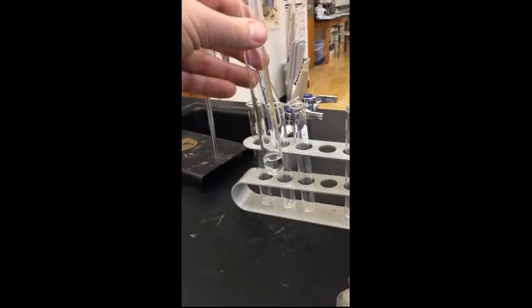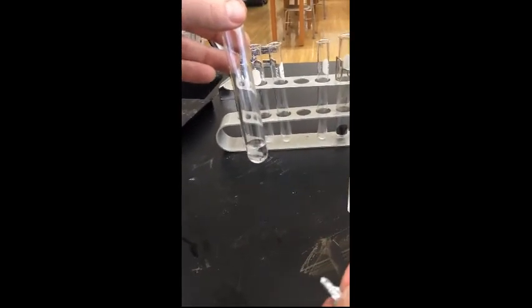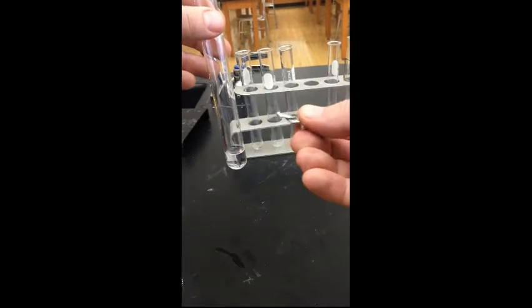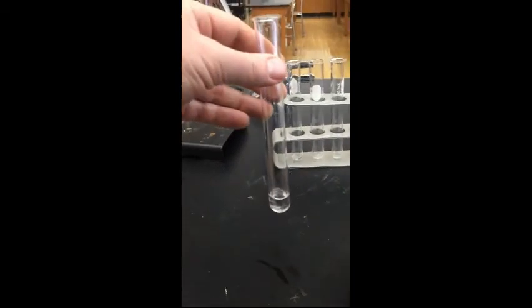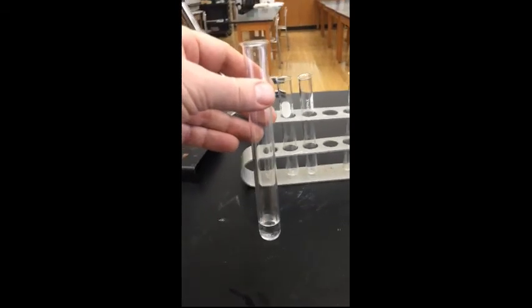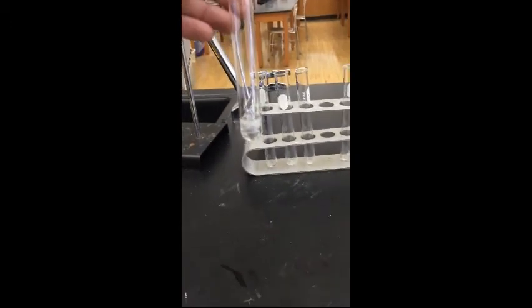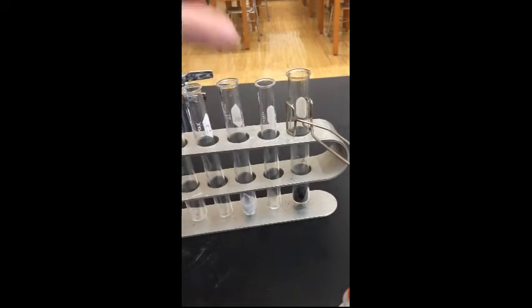Then I'm going to take a chunk of zinc and I'm going to put the zinc, you can see what it looks like beforehand. It's kind of shiny. It is pliable. It is malleable like other metals, yes. And I'm going to put it in the test tube with the hydrochloric acid. Now you can see what happens very quickly. I'm going to put it in the test tube rack. It's fizzing pretty well.